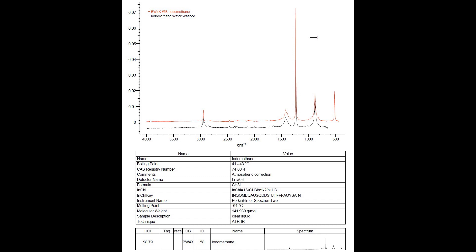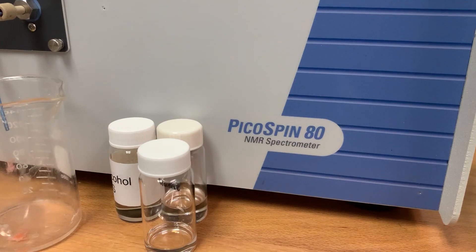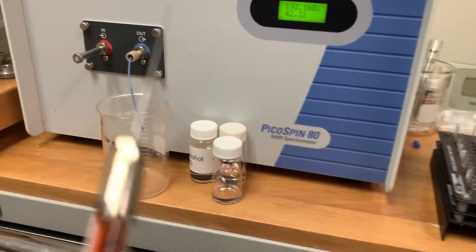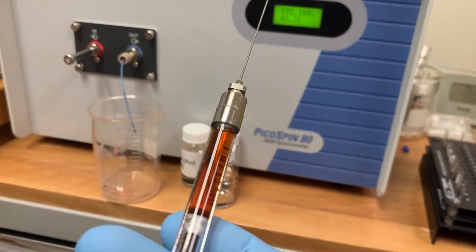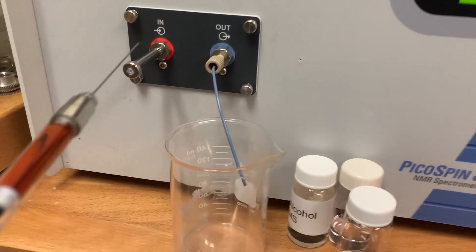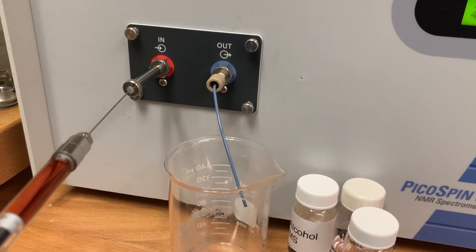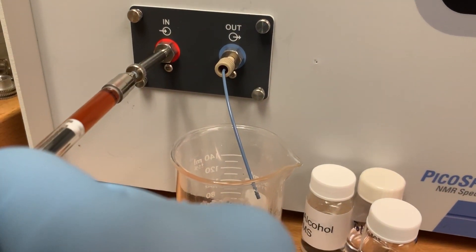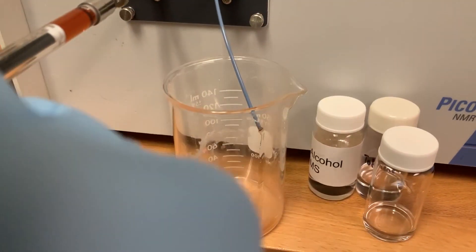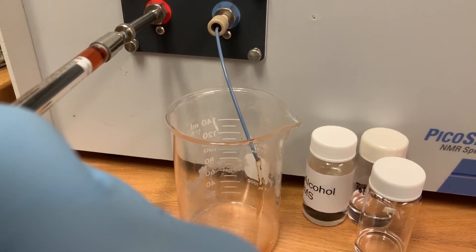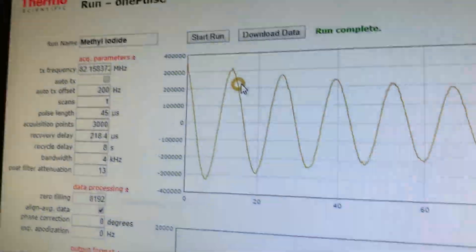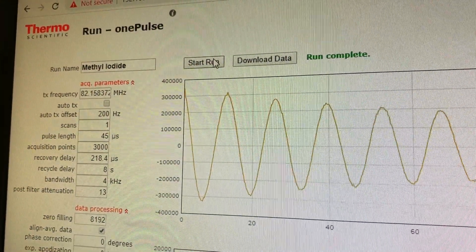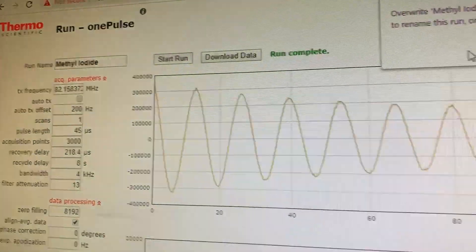Because I can, I decided I was going to run an NMR. This is a benchtop NMR unit. It runs at 82 megahertz. It uses a flow cell rather than NMR tubes to analyze the sample, so you just push it through, collect some of it out the other end into a beaker, and then switch over to your computer and collect a spectrum.